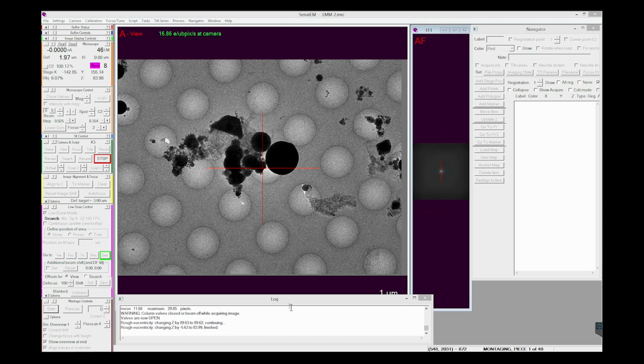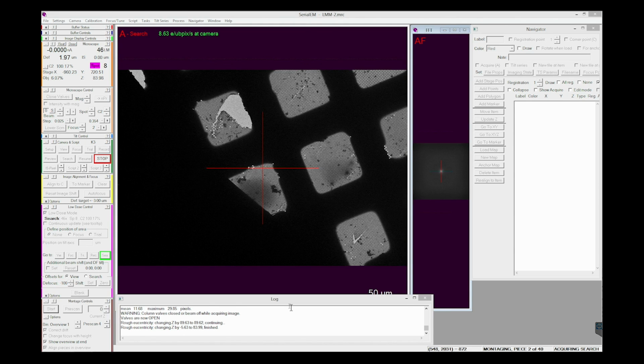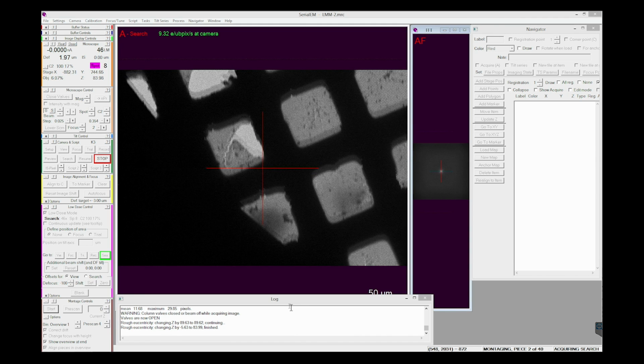Down in the bottom right, you can see the status. We are on piece 1 of 40. And once those 40 images are complete, we will be back here. So it's 11:35 a.m. today. Right now when this is started, let's see how many minutes this takes.